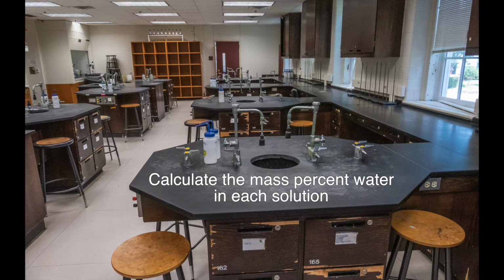Next, using the volume you just calculated and the densities you determined in Part 1, determine the mass of the DI water and the mass of the 2-propanol in each test tube. These values go in row 4 of each table. Adding the DI water and the 2-propanol masses together from one of the test tubes, you can determine the total mass of the solution. Finally, you can determine the mass percent water for each solution. Pause the video while you are completing these calculations.